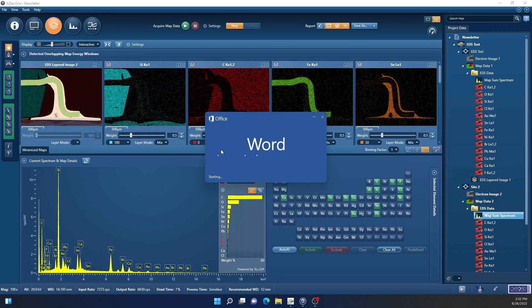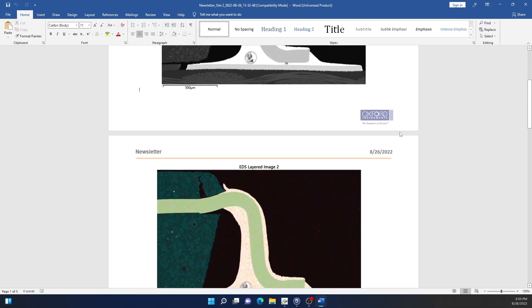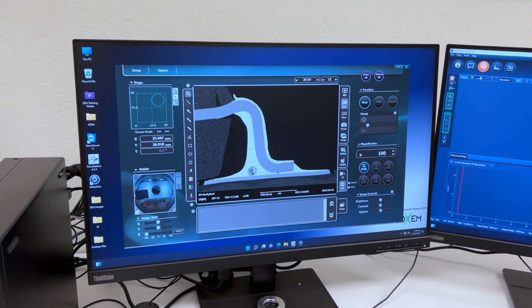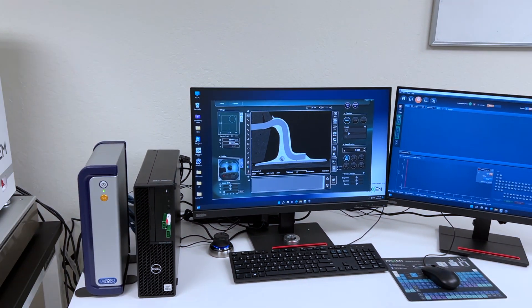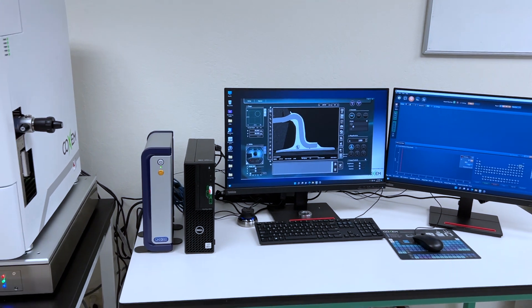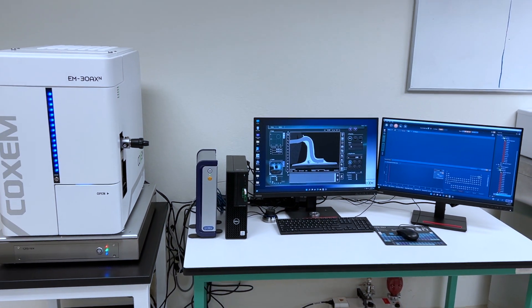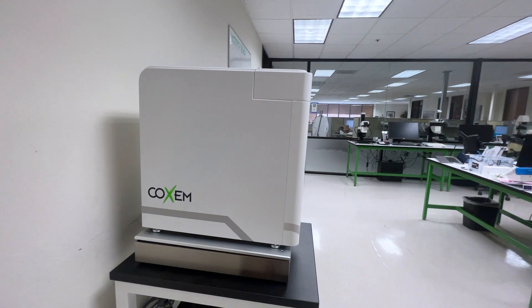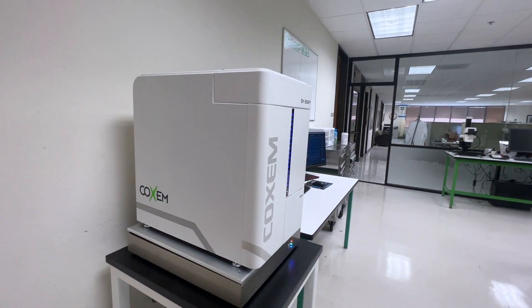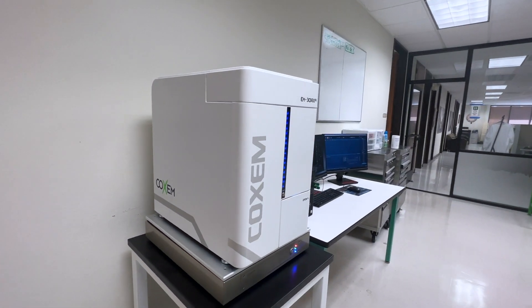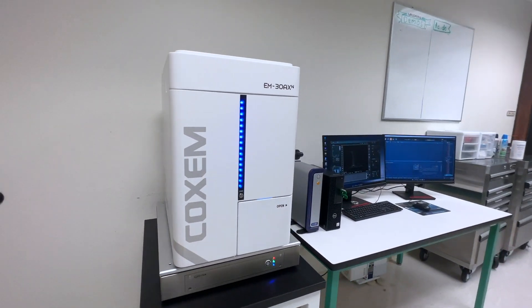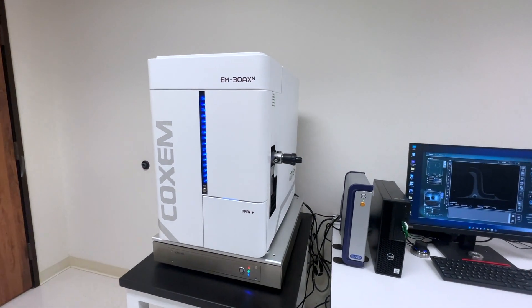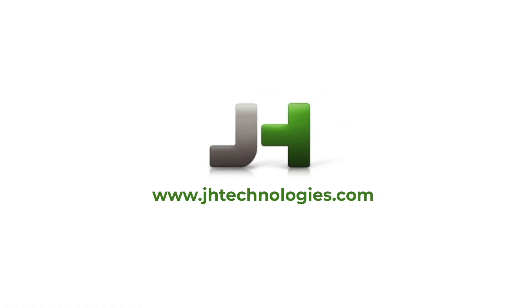A complete report with images is automatically created. Thank you for taking the time to view this introductory video of the COXEM tabletop scanning electron microscope. If you would like to try a sample or require additional information, please contact us at www.jhtechnologies.com. Thank you.